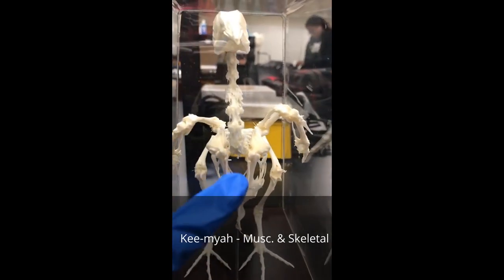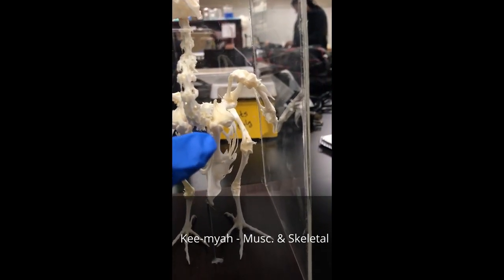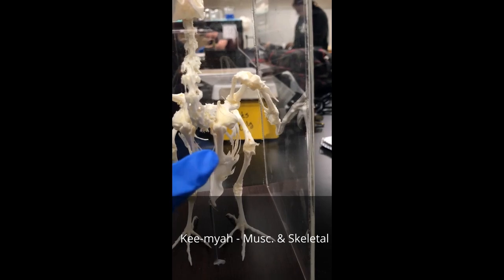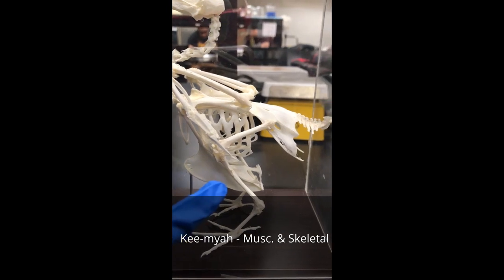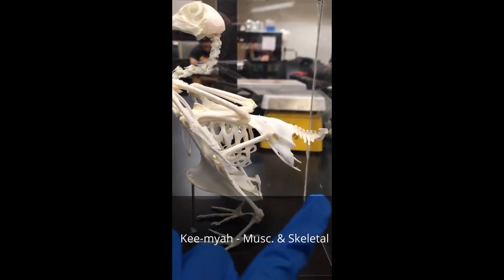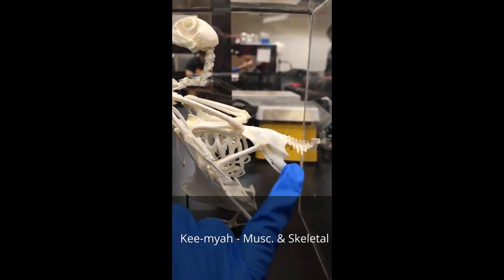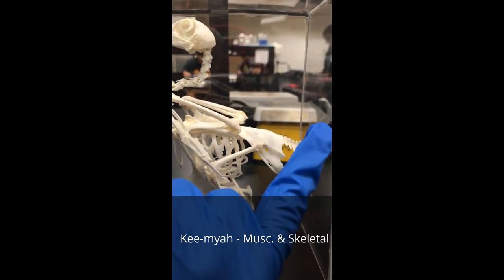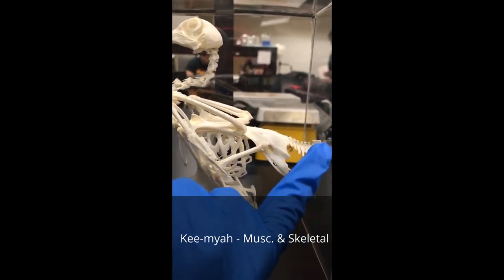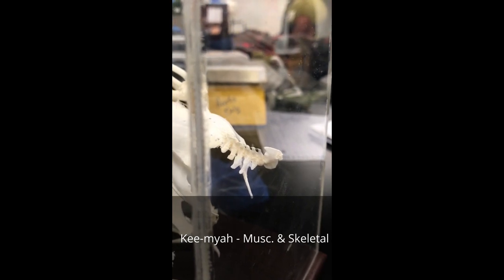This is the clavicle here, and behind the clavicle, it's a larger bone that they call a girdle. You can see the sternum/keel with the rib cage, and they have a pelvic girdle here. This is the pelvic girdle, and on the tail it is called the caudal vertebrae, and the pointing end that you can see here is called the pygostyle.